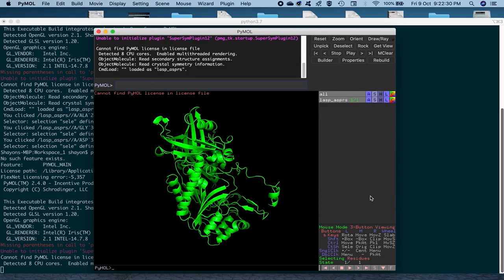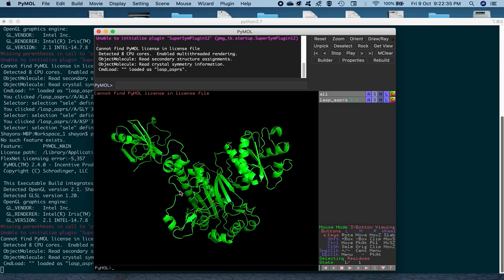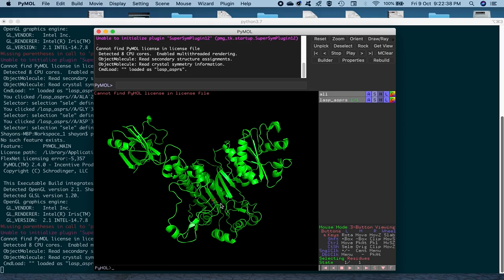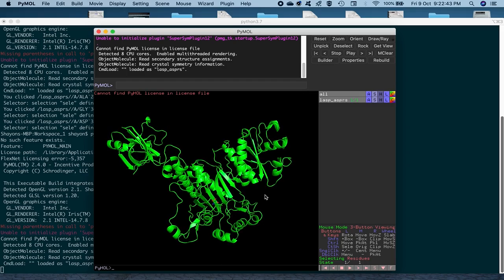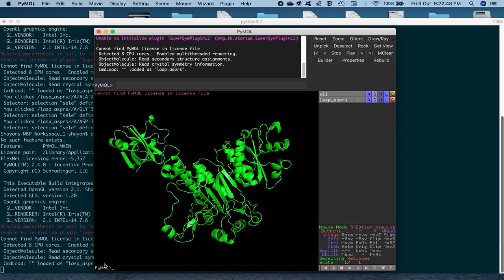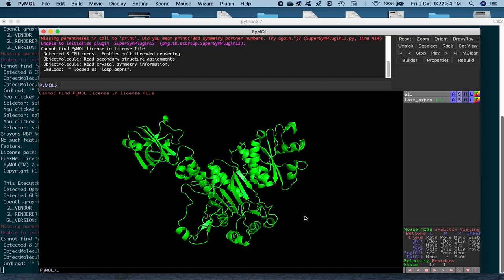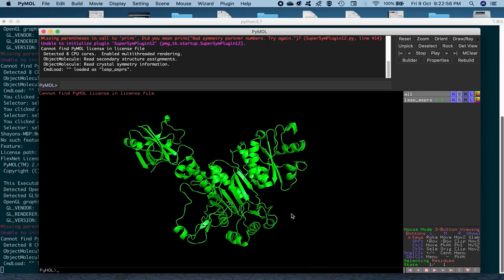So we open the structure, and as you can see, it's loaded already in the new cartoon or the ribbon representation with the ligand that's named AMO out here, but it's actually L-asp being represented as licorice. So that's great. We don't need to do any kind of change in the representation. I could show you more about the features of the representation, and PyMol as well, like Chimera and VMD, can create beautiful pictures. But then again, the focus of this tutorial is not the representation. We'll deal with it in some other tutorial.